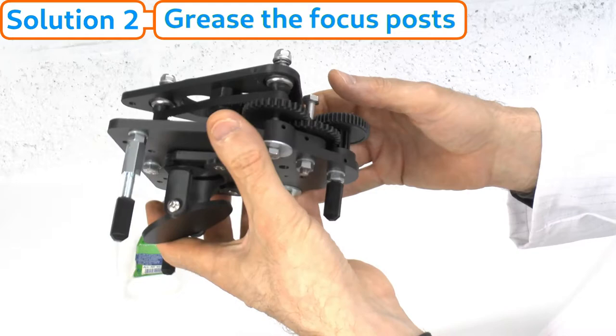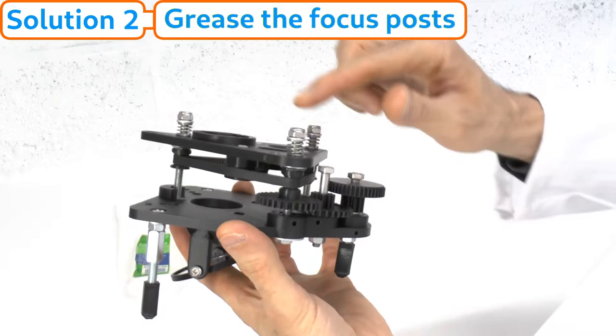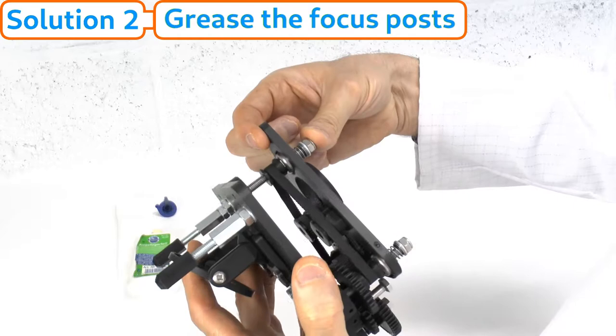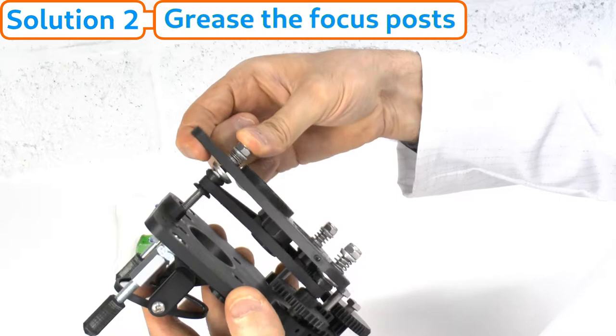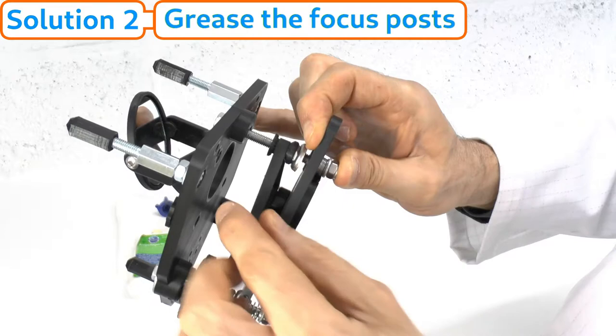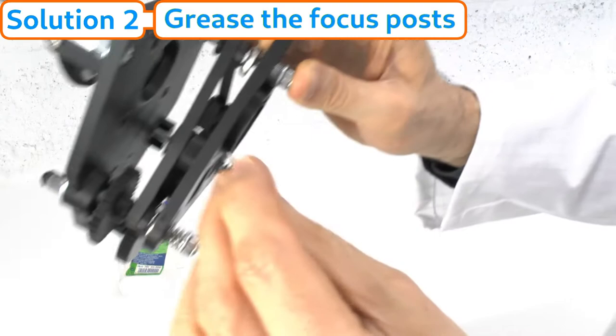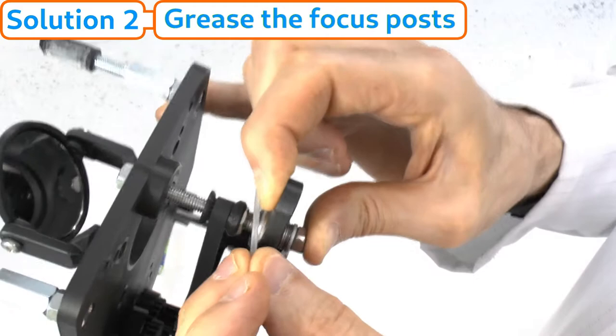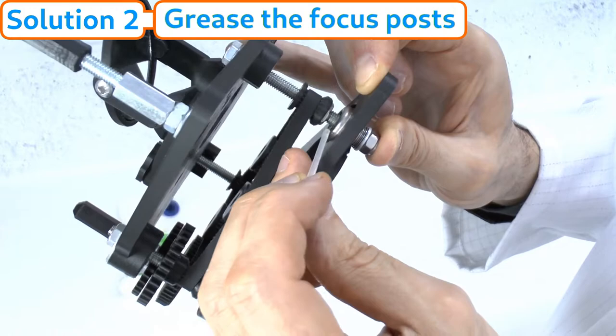Now that we've lowered it as far as we can go, we do the same procedure for each of the three focus post springs. Put your thumb on the nylock nut and your finger on the under surface of the focus platform, and simply pull it up to compress the spring and reveal the thread beneath. The screw cap washer is loose, so push it down to expose the thread. Here's the thread and the top nut of the focus pulley — this is where we're going to apply the grease.